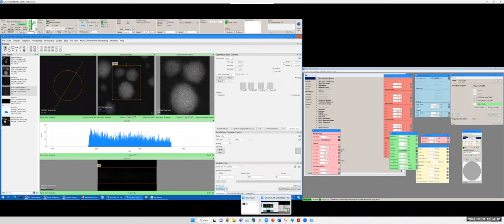Okay, click start acquire. So you should spend time to get familiar with those windows. I don't have time to cover all of those, but I cover the most frequently used ones. And then you can start to explore, like click what they are and see what's going on. Okay, it's all okay to try this Swift software. They won't damage anything. So you're welcome to try and take notes and ask questions. Okay, so this is still going on.